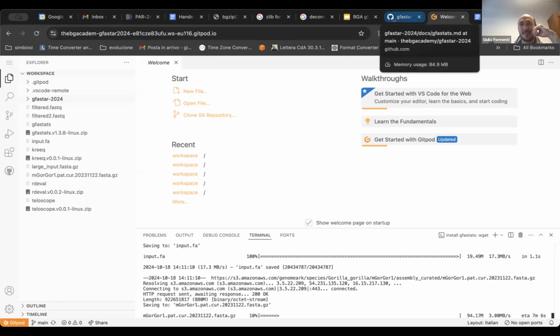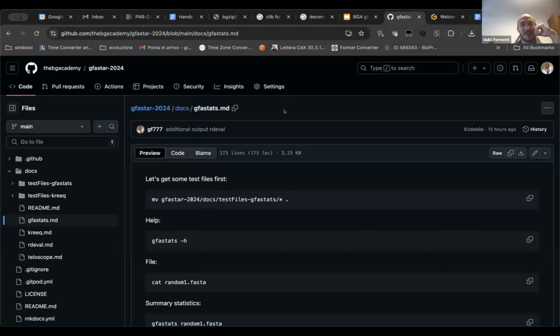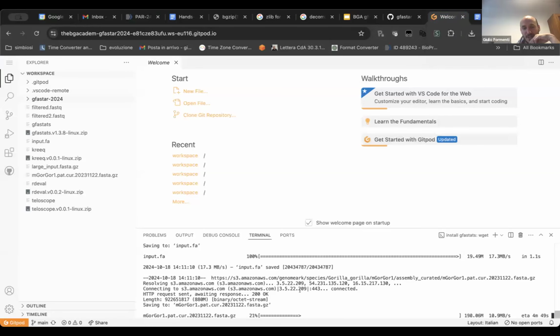And I'm going to keep it simple. So basically, honestly, you could even stop listening to me and do it yourself, because it's pretty self-explanatory. But basically, we have MD files for the 4 tools. So README files for the 4 tools in the same folder. We're just going to follow step by step. The only addition would be that I can give a bit more of an explanation, and Jack can also give a bit more of an explanation.